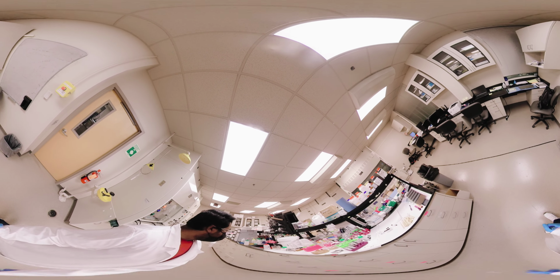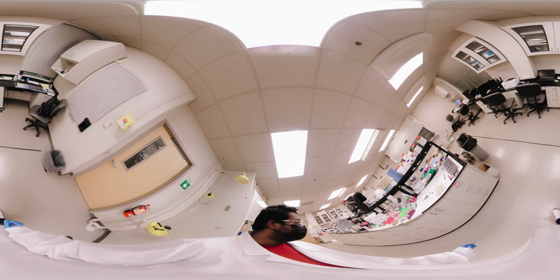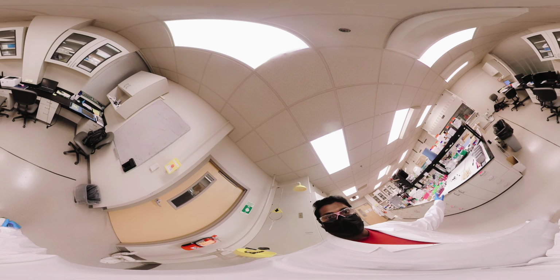Each person has a personal bench top, and they do most of the chemical work over here. But if the chemical work would be a little bit harmful, then you have to do it in a hood. This is the section where we sit and do the analysis of our experiments.